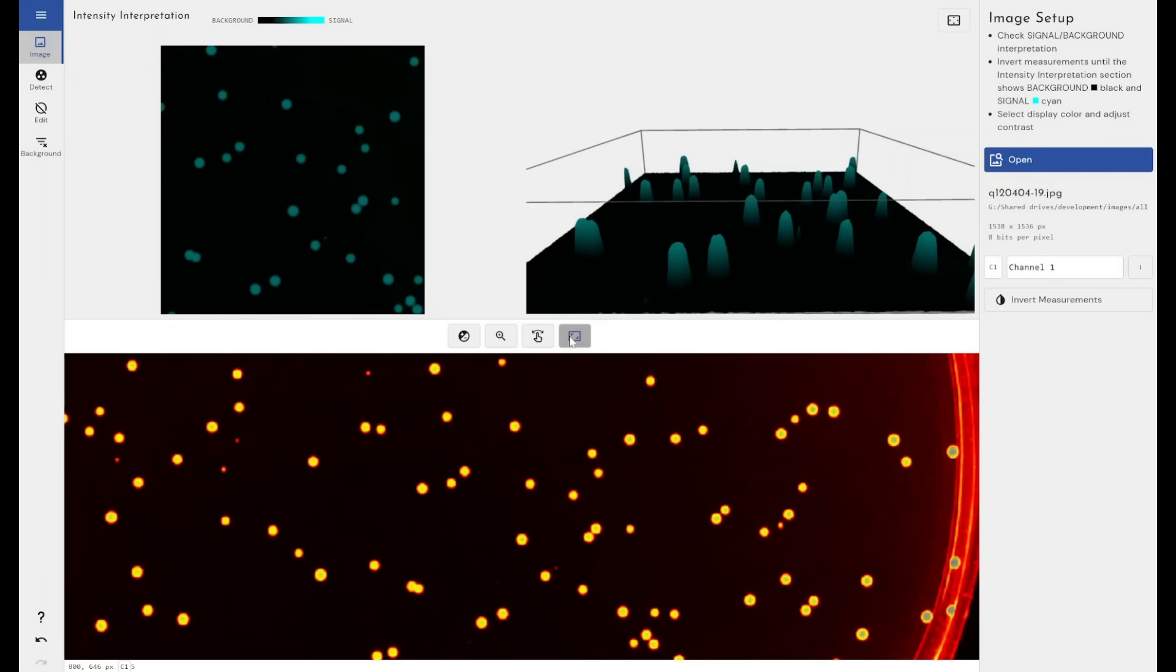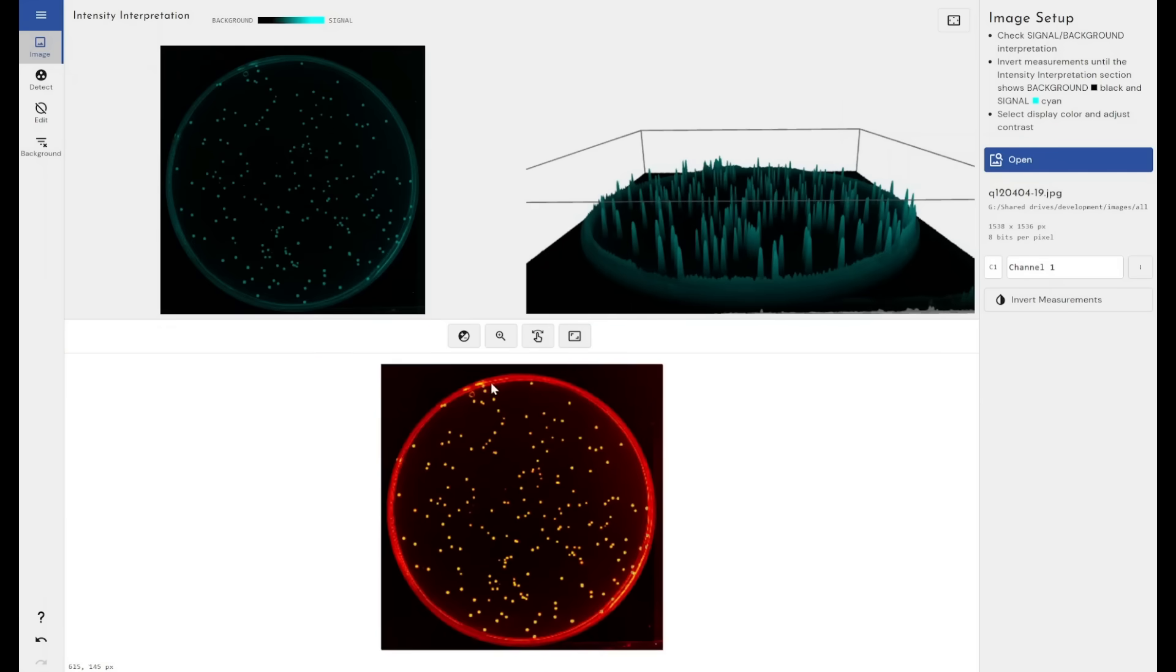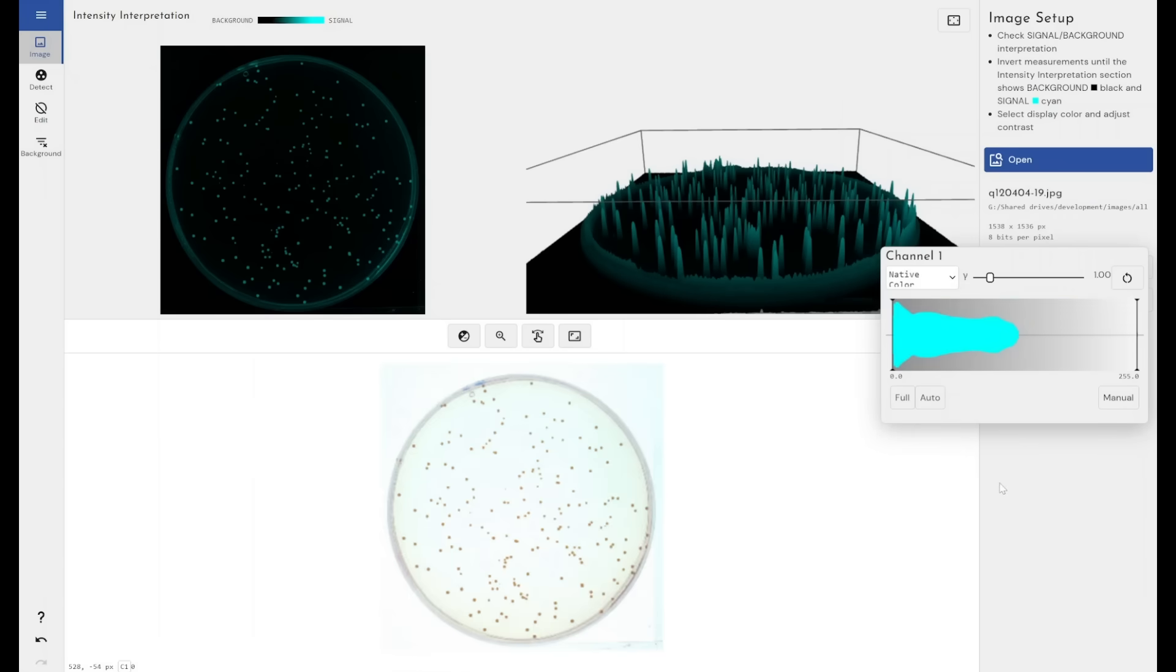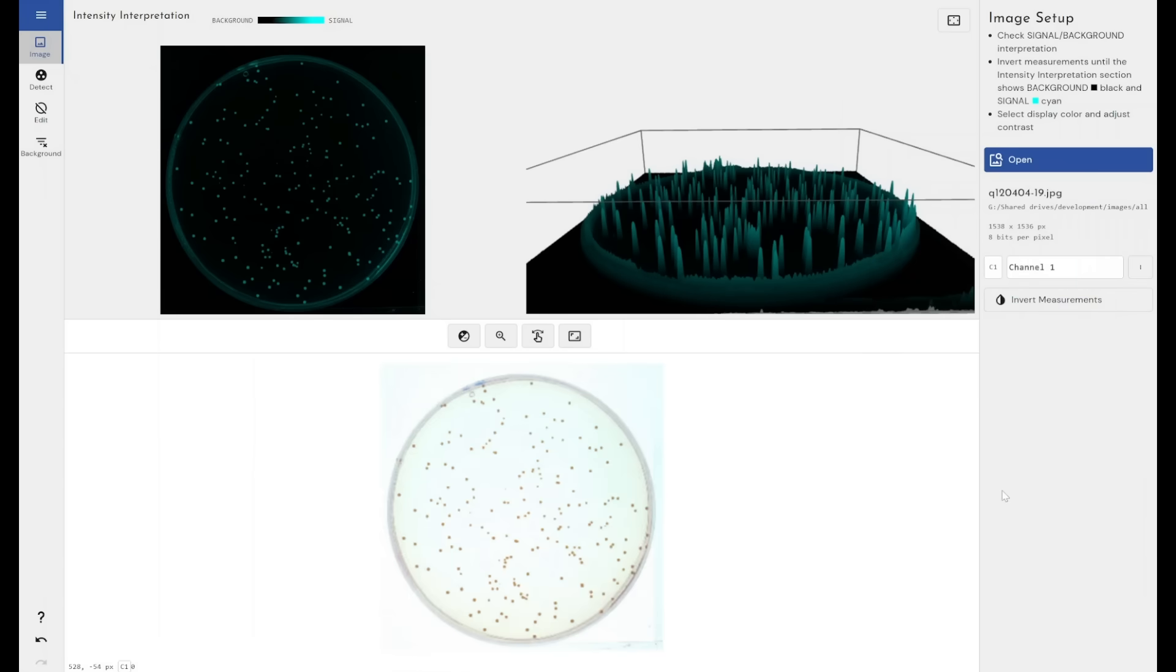We've got all of those options available to us. I'll just reset this back to the native color here. All those options are available to make the job of the analyst much easier.